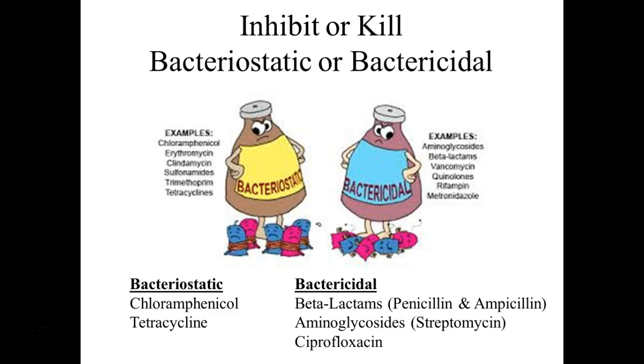We had some new antibiotics that we had gotten in, and so the SXT is actually 2 drugs on that disc. Both of them by themselves are bacteriostatic, so they would inhibit. But when you use them in combination, they are bactericidal, right? So they will actually kill. And so drug interactions matter too.